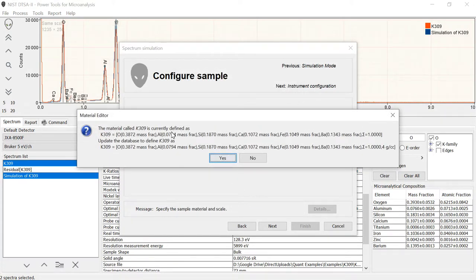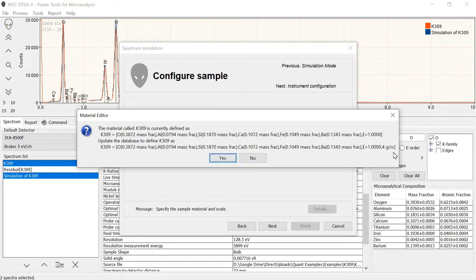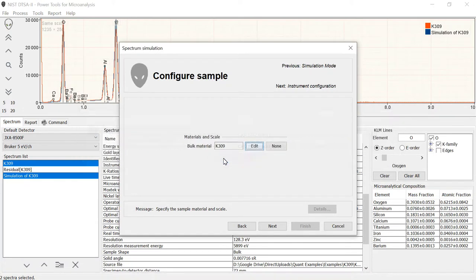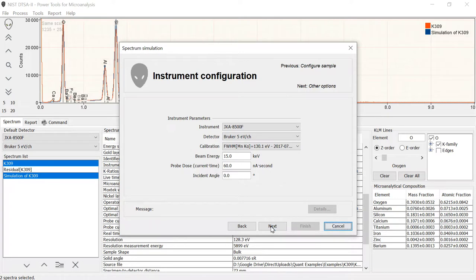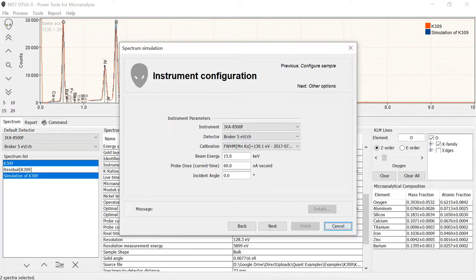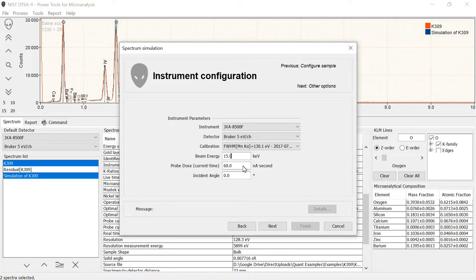So K309 density for these mass fractions and I select OK. It's going to ask me if I want to update this information in the database because I've now added this piece of information, the density, and I'm going to say yes I want to update the database. Next. OK. It's asking me again what instrument and what detector and what calibration do I want to simulate this for? We're using the same detector, the default detector because that's the one this was collected on. The beam energy, 15 kV, that's consistent with what the spectrum was collected at.